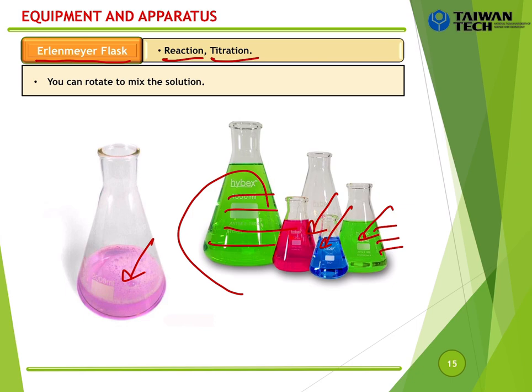And when you add the chemical inside, you can rotate to mix the solution. So it means that you use your hand to hold the neck of this flask, and you rotate like this, and then the solution inside can mix well, okay?